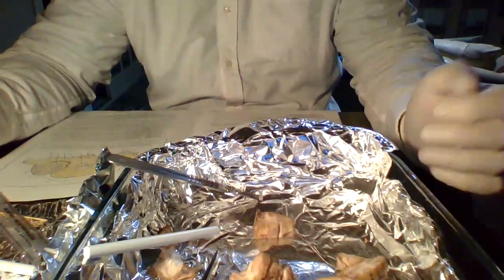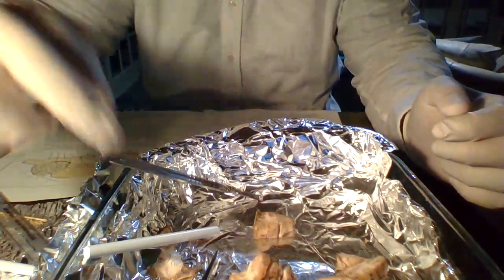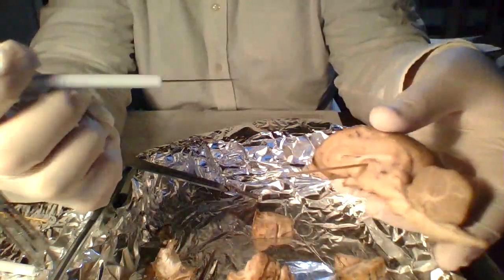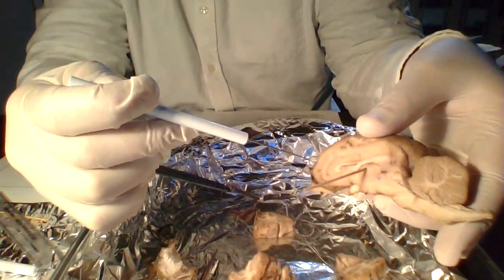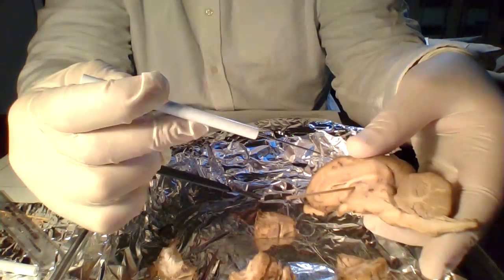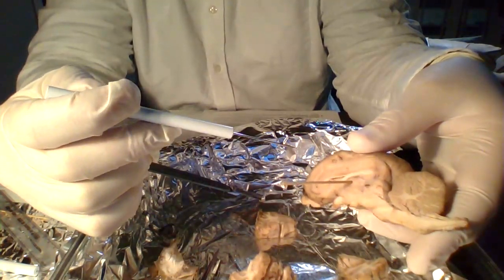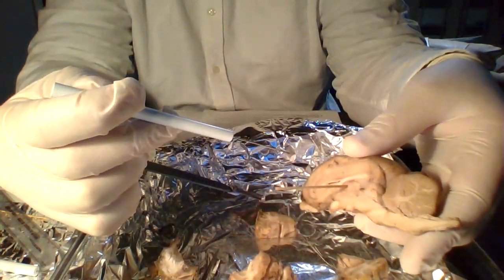Going down the list of the workbook in front of me, let's identify the frontal lobe of the cerebrum. The frontal lobe is approximately this area. Each of the lobes is not well defined due to the organic nature and randomness of how big and how long and the distribution of every single brain across a bunch of sheep, or every single member of a species.